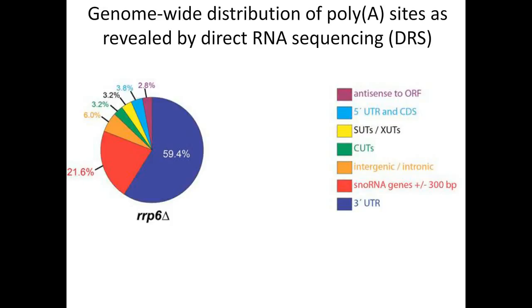So if we look at the direct RNA sequencing results and what they revealed for these samples, when we inactivated the nuclear exosome, we can see that a substantial fraction of the transcripts map to the 3' UTR, which is what we expect for the protein coding mRNAs.